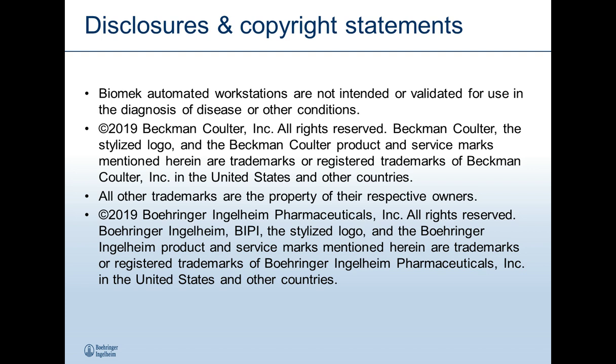Network connectivity is a big issue, and it tends to be a little easier in academia versus corporate environments. For example, our two automated platforms that we have in my lab now, one that was integrated by PerkinElmer and one that was integrated by Beckman Coulter, neither of them are actually compatible with our corporate firewall. So those platforms are not on our network, and we have to physically transfer those files through a gateway computer. Those restrictions tend to vary from company to company and academic institution to academic institution.